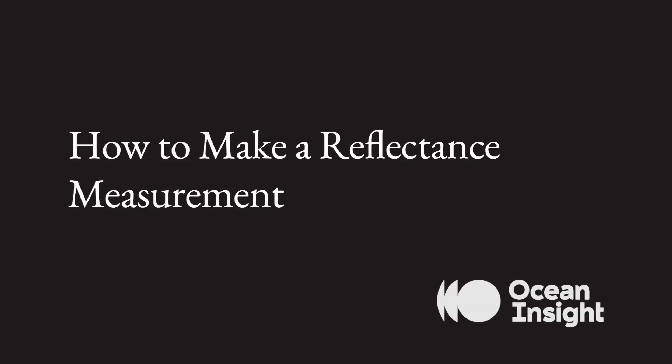In this video, I'm going to show you how to make a reflectance measurement. As a sample application, I'm going to show you one of the most common applications that's used for reflectance, and that's a color measurement.